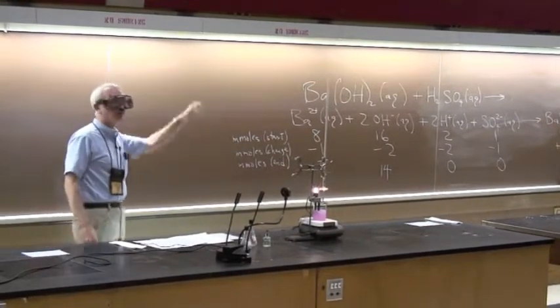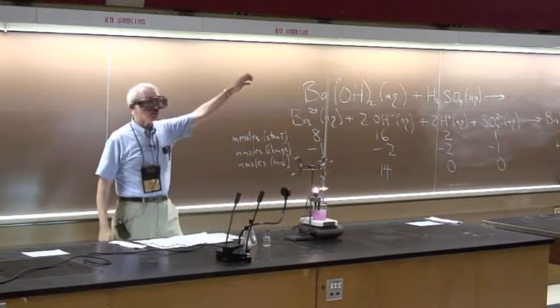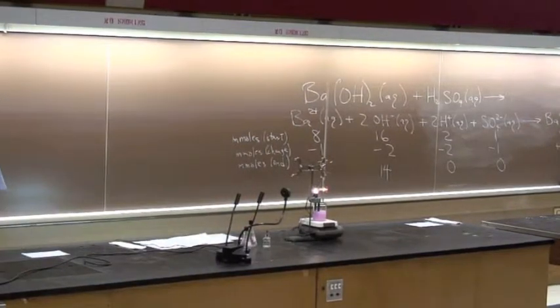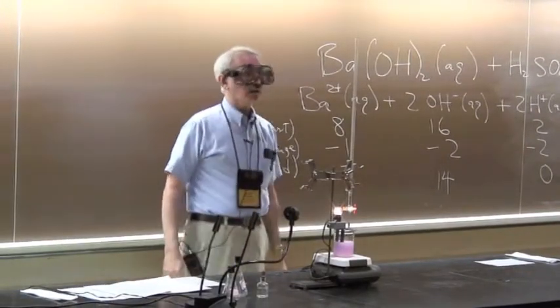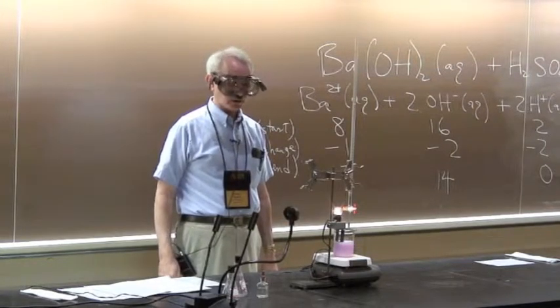And how many think the pink will eventually go away? And how many think it won't? Let's try it. And as you can see, the light stays on. And the pink remains. And nobody going that way. So I'm sorry to see that.